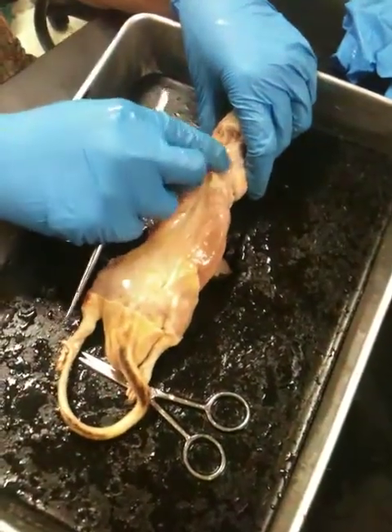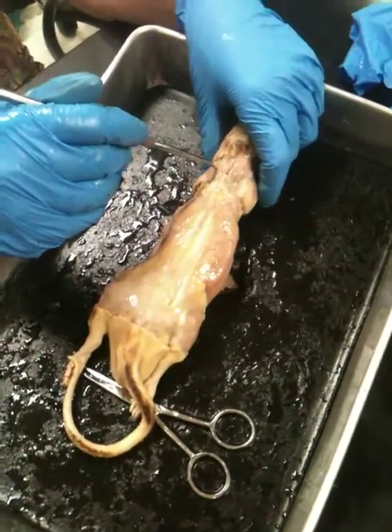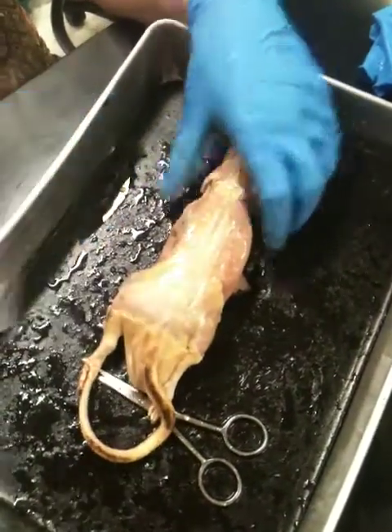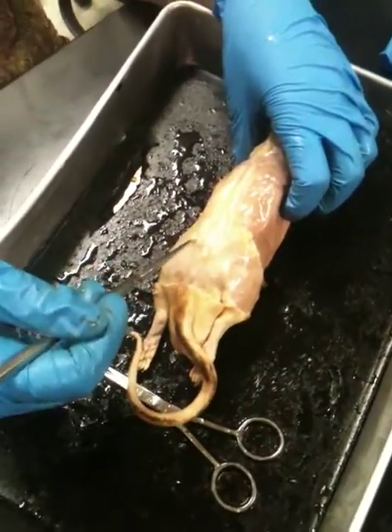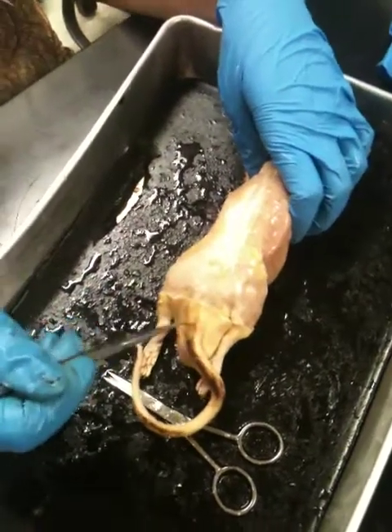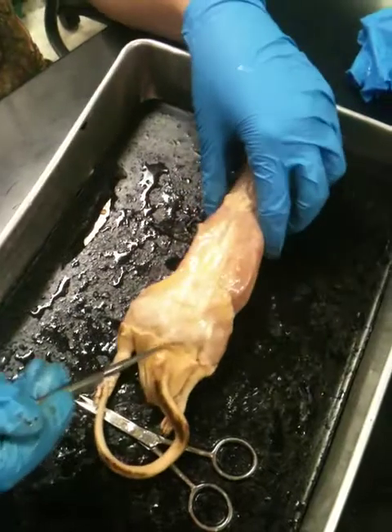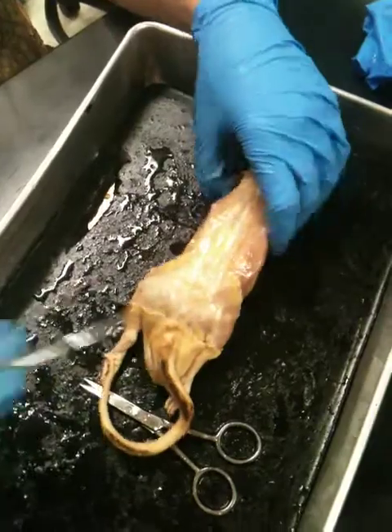When you feel the rat, you can feel these shoulder blades. So this is going to be, what do you guys think? Scapular? There we go, scapular. Alright, when you're going off to the lower part, about here and about here, this is going to be lumbar. When you go towards the base of the tail, the rat really does not have an obvious butt. It doesn't really need to have well developed muscles there. But this is going to be the gluteal subdivision.